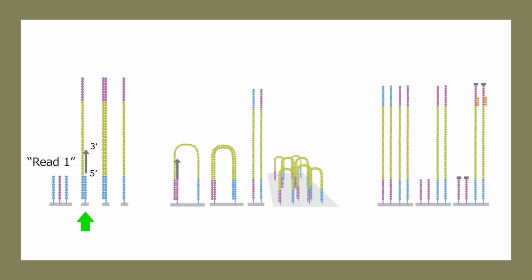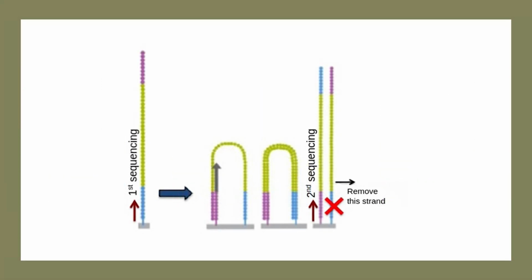It is not the purpose of this tutorial to teach sequencing chemistry, but the abridged version of how this happens is that something called bridge amplification occurs, and during this process, the DNA becomes secured to the second oligonucleotide and can be denatured from the first oligonucleotide it was originally bound to. It is now upside down relative to how it was oriented before, and sequencing commences from the other end for 150 cycles in our case. This second round of sequencing creates the paired end read to the first round of sequencing.